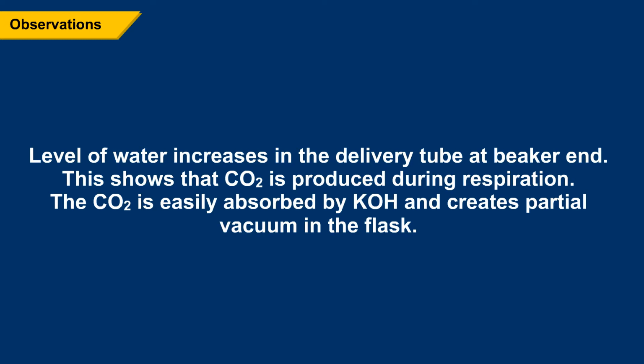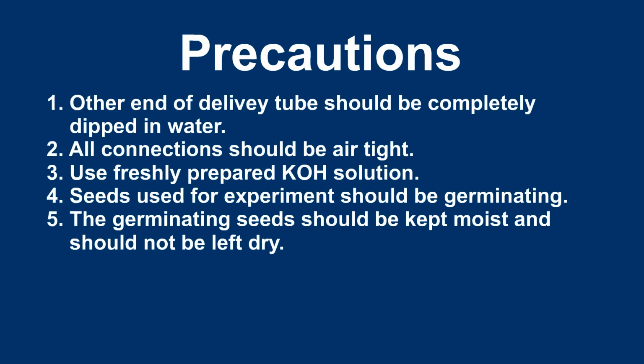Precautions: other end of delivery tube should be completely dipped in water. All connections should be airtight. Use freshly prepared KOH solution. Seeds used for experiment should be germinating. The germinating seeds should be kept moist and should not be left dry.